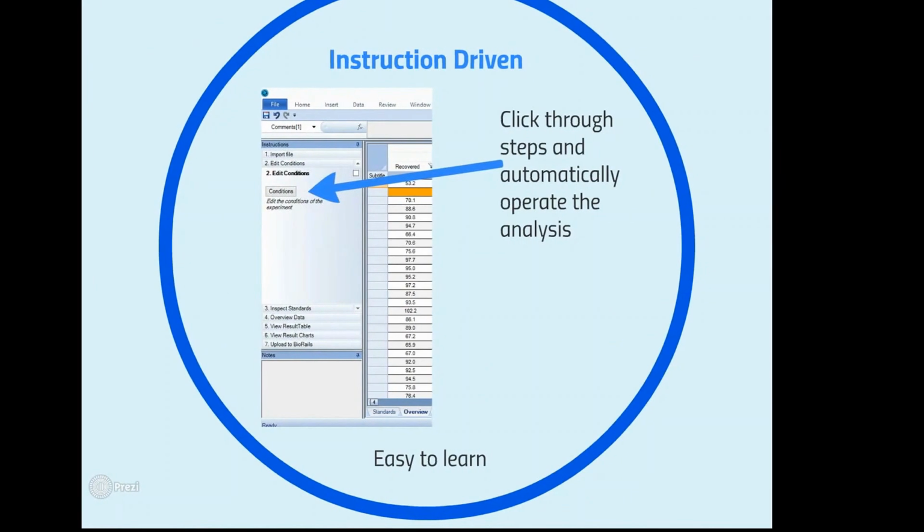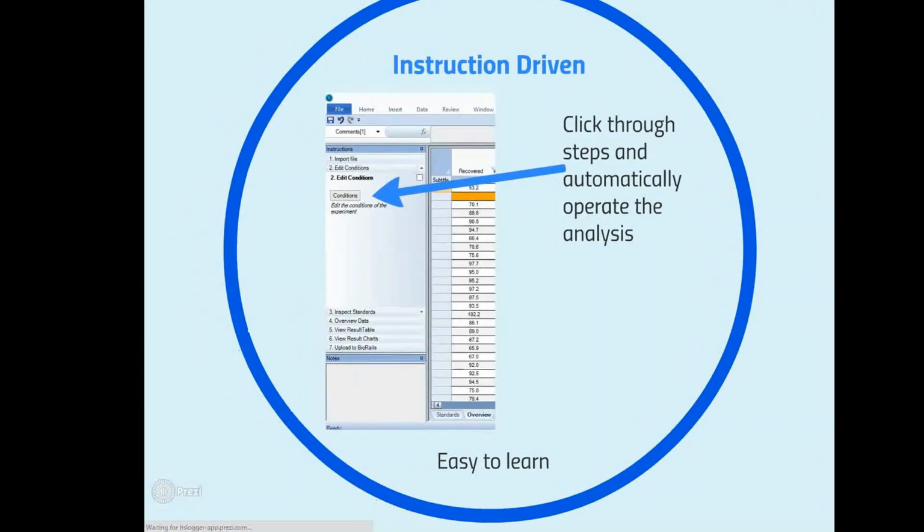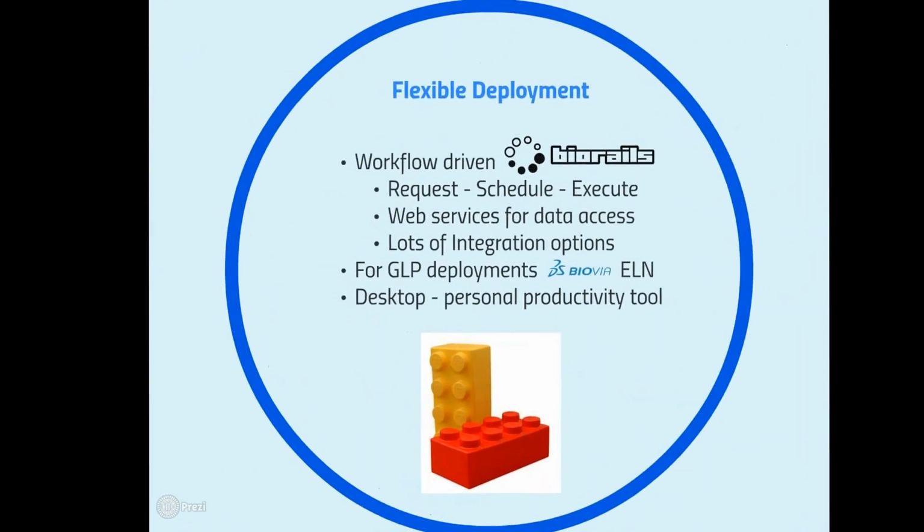As I mentioned, it's all instruction driven, so there are a simple set of steps that you can follow through the instruction sheet to drive your analysis. That makes it easy to learn for end users using the system, so it guides them through how to run their analysis and process the data.